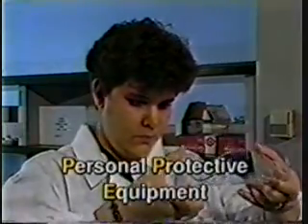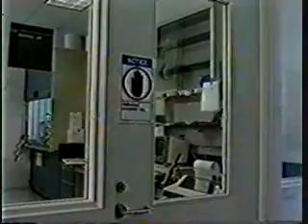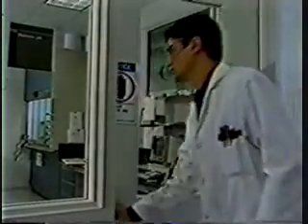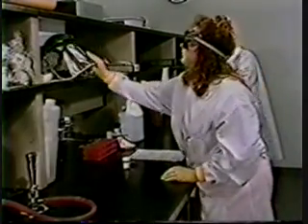The first step is to wear the appropriate personal protective equipment. Safety glasses are usually the minimum requirement for eye protection in the laboratory. Work involving corrosive liquids or other splash hazards may require goggles or the addition of a face shield.